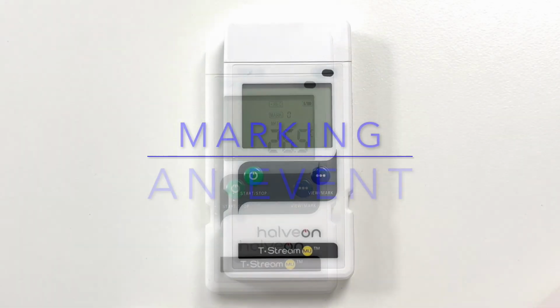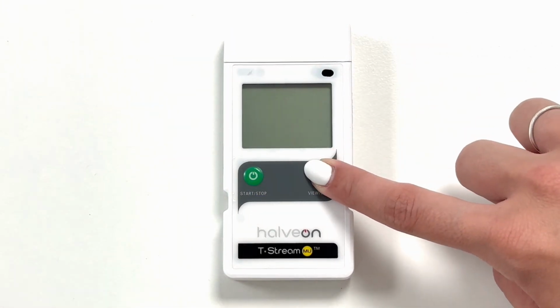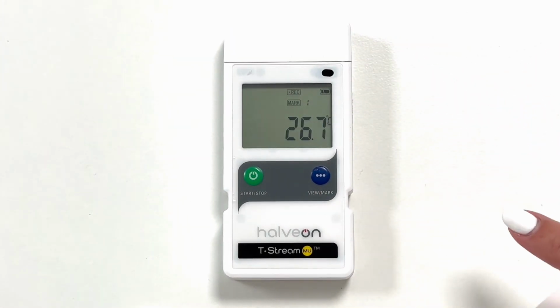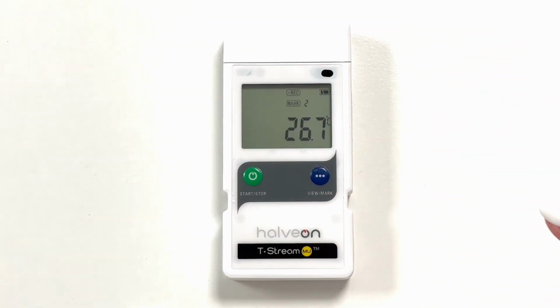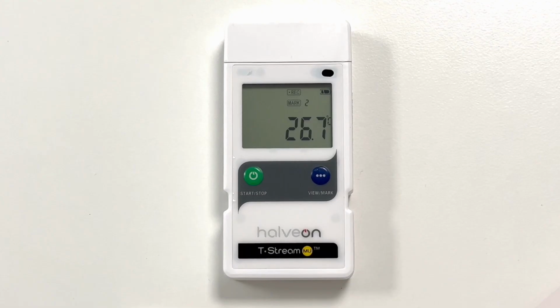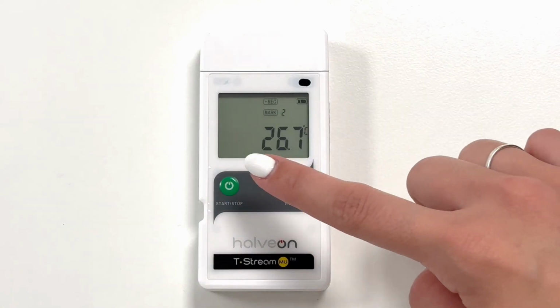Part 5. Marking an event. The user can double press the View Mark button to mark an event at any time while the logger is recording. The mark will show in the report and the number beside the mark indicates the times that the logger has marked the event, 8 being the maximum number of marks. So, click once to view and twice to mark.